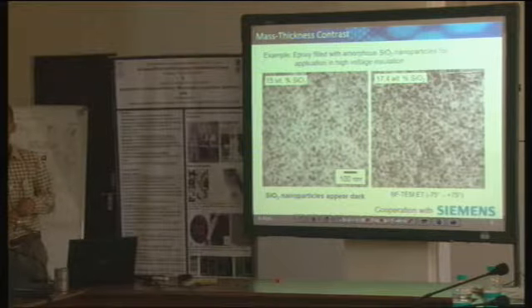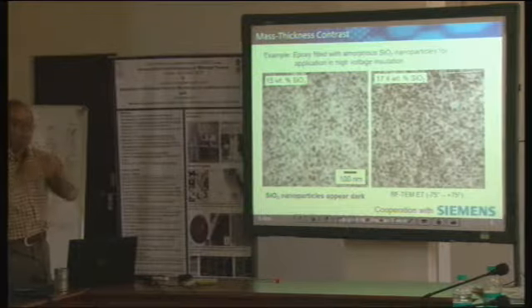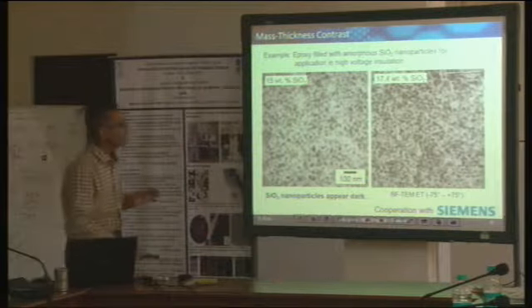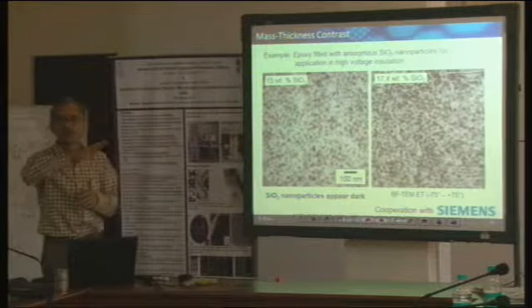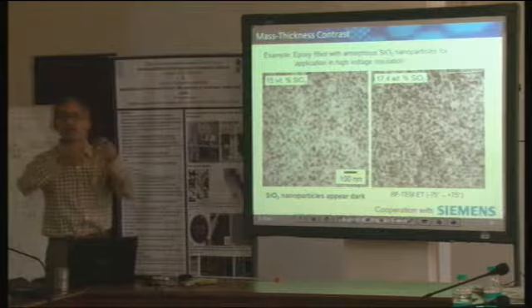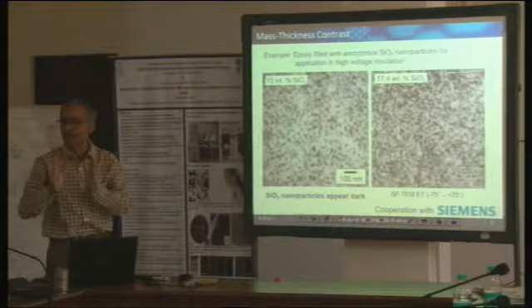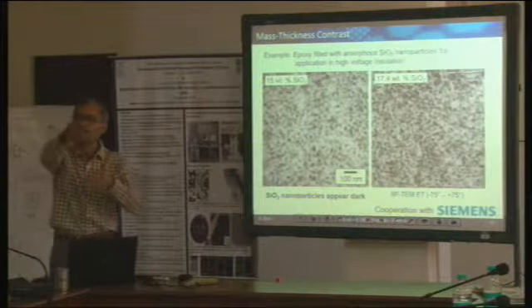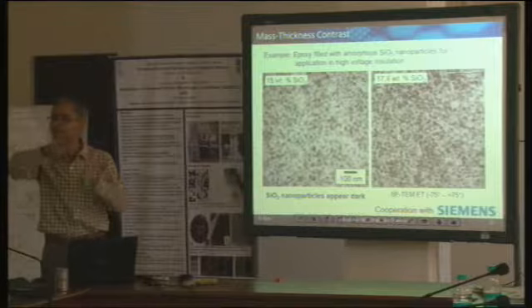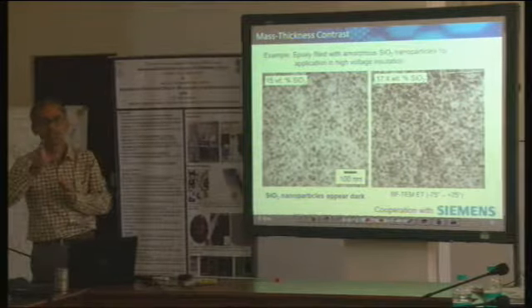That will give some shadow. Okay, so I will give the answer. See, we are making the tomography. The aim of tomography is to reconstruct that image in a three-dimensional view. So they are going to sum up all these many images which they acquire at different angles, and draw some conclusion regarding its three-dimensional shape.